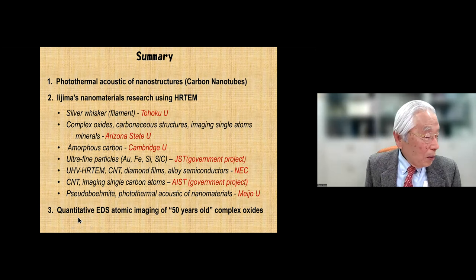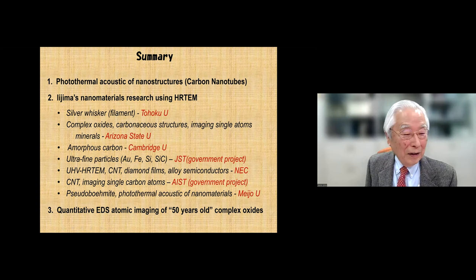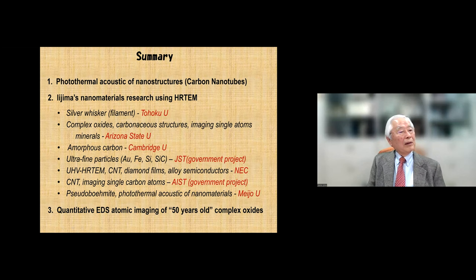The last one is my current study, and it's quite interesting. I did this 50 years ago, and the same materials are still very interesting, not only to me but also to other lithium battery people talking about this oxide. So maybe as electron microscopists we can contribute to many areas like battery research. Microscopy is very, very important.